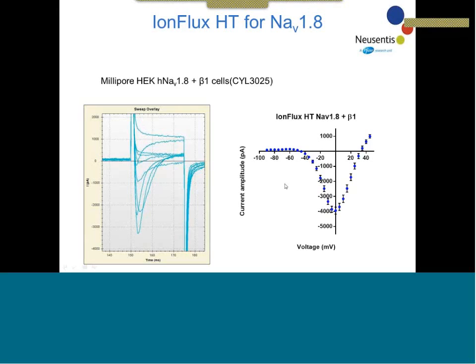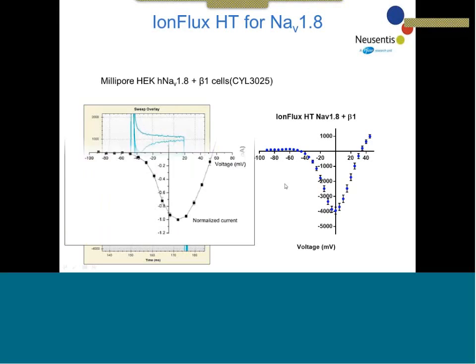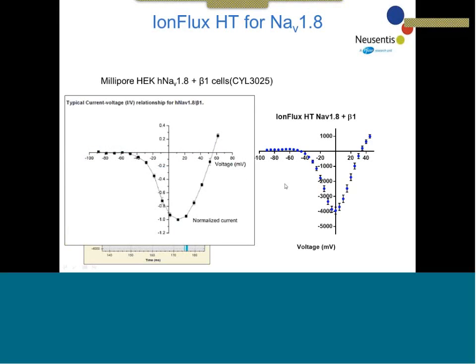And we're actually running some screening right now on the IonFlux for voltage-gated targets as well. And just to show you the comparison, here's the data from the Eurofins or Millipore brochure for this cell line, and our IV is in fairly good agreement with the published values. There's a little bit of a shift in the peak and the reversal, but the buffer solutions were ever so slightly different, and we didn't have any compensation switched on here. So I'm quite happy with that.